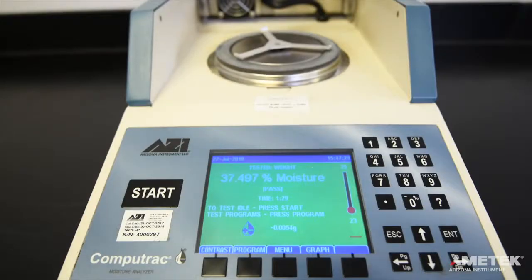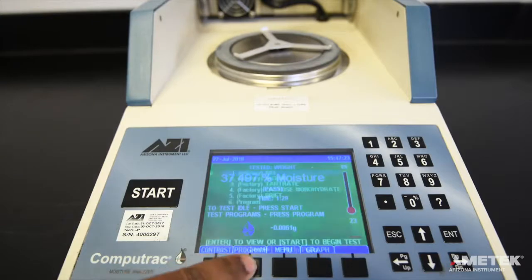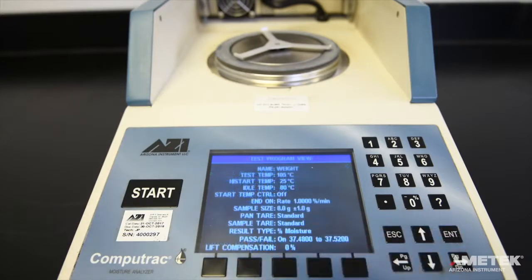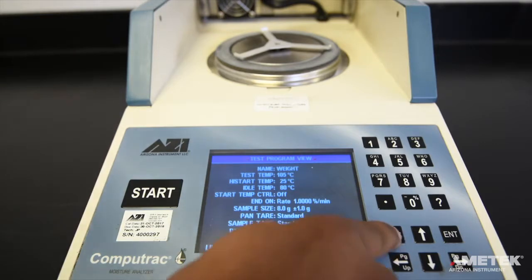From the home screen, press the program button, then use the directional keys to highlight the factory weight program. Press enter to select the weight test, then return to the main screen by pressing escape twice.